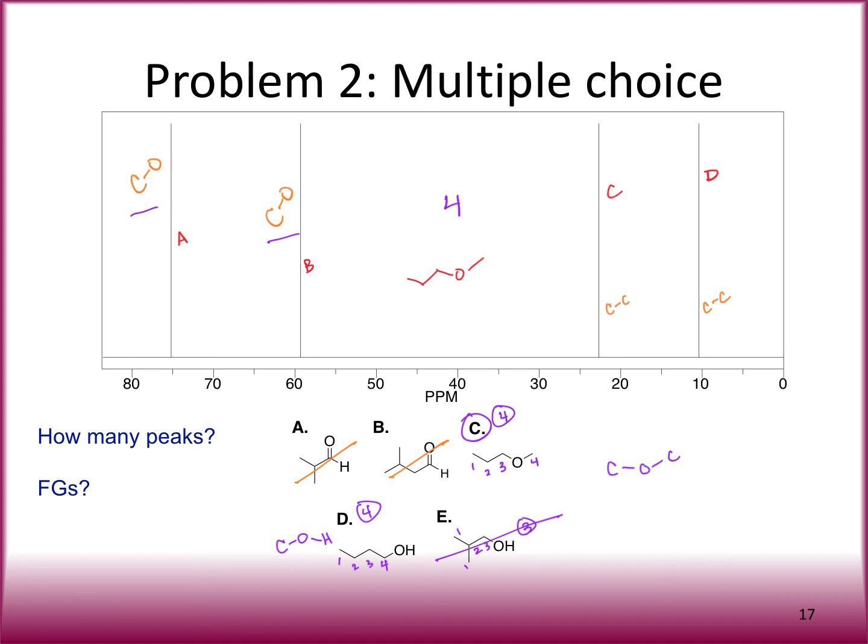So I'm going to go ahead and label them. So I know that that's what they are, but if you for some reason wanted to switch those, that would also be okay. So if you had the green letters, that's also fine, okay? All right, so then we need to do C and D. C is probably going to be closer to an electronegative atom, so that would be this carbon here, and then D is going to be at the very end. Does that make sense?